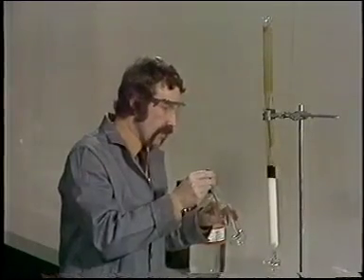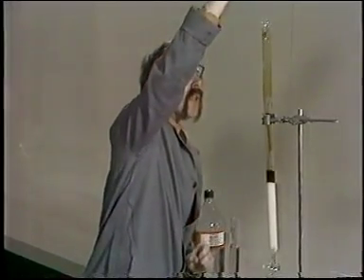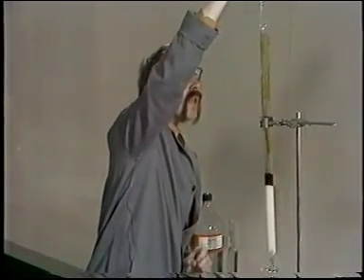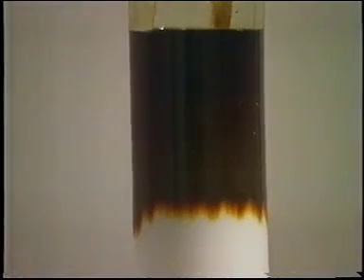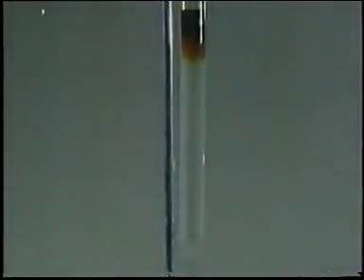More of the first solvent is now added to run the mixture through the column. We can see this better if we speed up the action. Bands develop and move down the column, and eventually they're eluted from the bottom. The solvent polarity is gradually increased to elute the more polar substances.